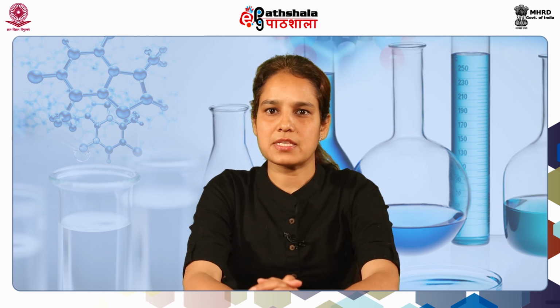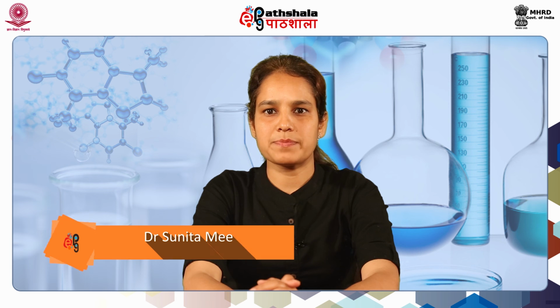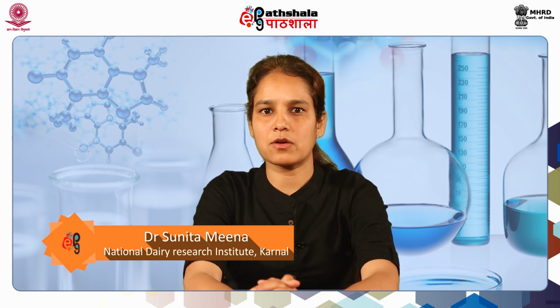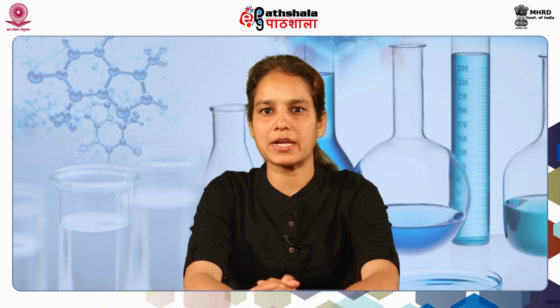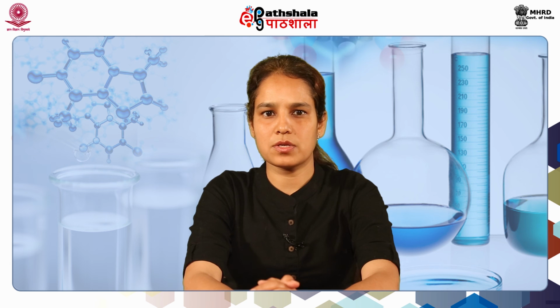Dear students, if I summarize what has been covered in today's presentation, I can say UV visible spectroscopy is a very powerful spectroscopic method for identification and quantification of analytes. Visible range is used for colored solutions, while UV range is used when molecules have characteristic bonds. The glass cuvettes are used for visible range, and quartz cuvettes can be used for both the UV and visible range of electromagnetic radiation. Concentration of analyte can be calculated from its absorbance and the molar extinction coefficient.